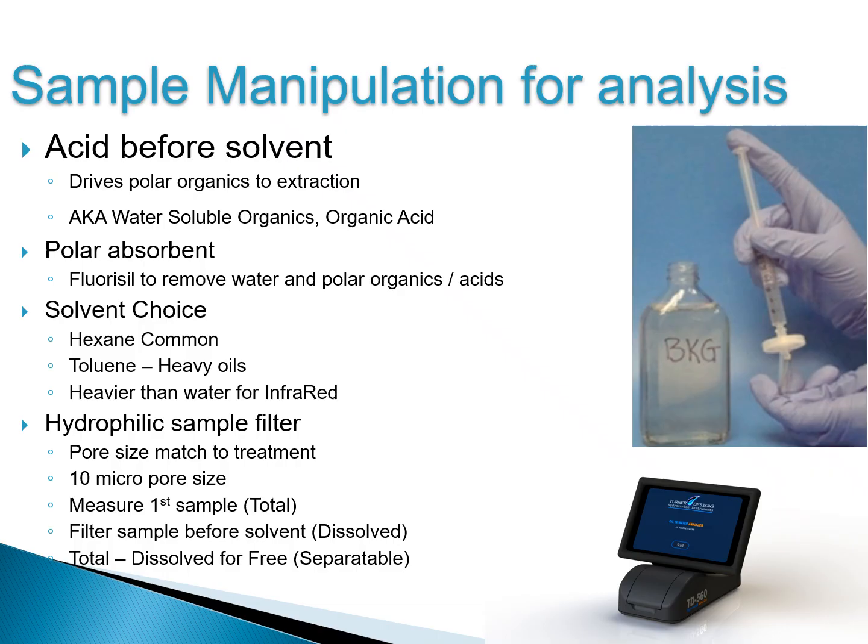This is very helpful if you have a water treatment system that removes everything larger than 10 microns. You can't expect that water treatment system to remove small particles. It's not designed for that. So analyzing the sample to know what is or isn't in there by particle size tells you if that water treatment system is meeting your expectations or not.